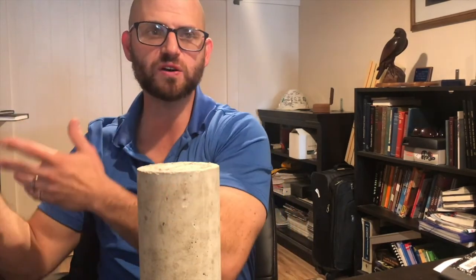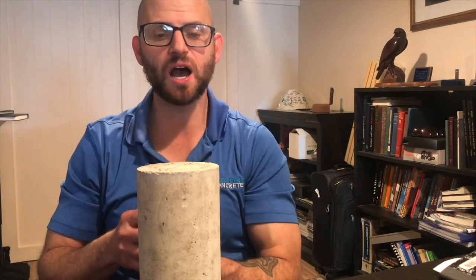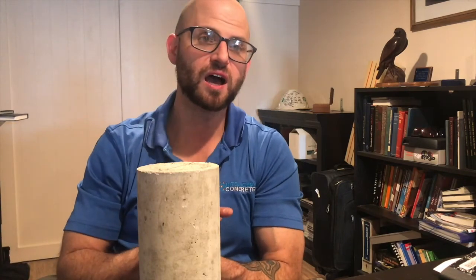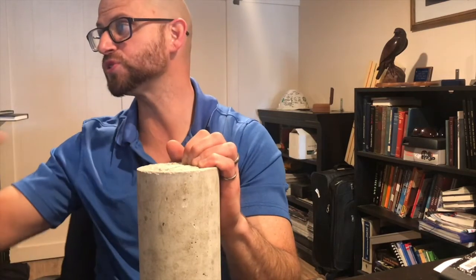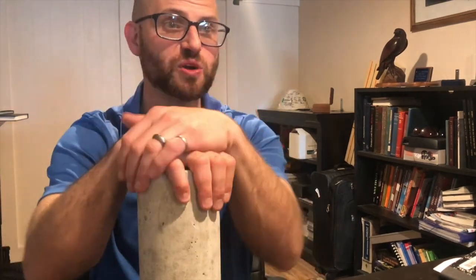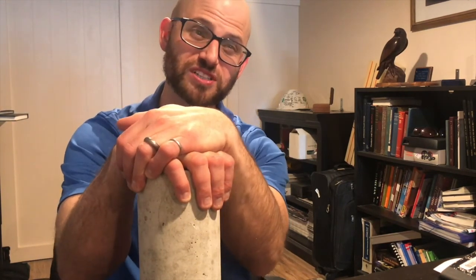And what we found with this scanning electron microscopy is we could identify what was happening to pastes that were giving us subpar results versus pastes that were giving us superior results. And we can do the same thing with admixture changes, with changes in the water cementitious ratio. So we did see a direct correlation, or at least connection, I think is a better word, between what was happening macroscopically versus what was happening microscopically. So if you have any questions, that was a talk on scanning electron microscopy, connecting it to the real world.